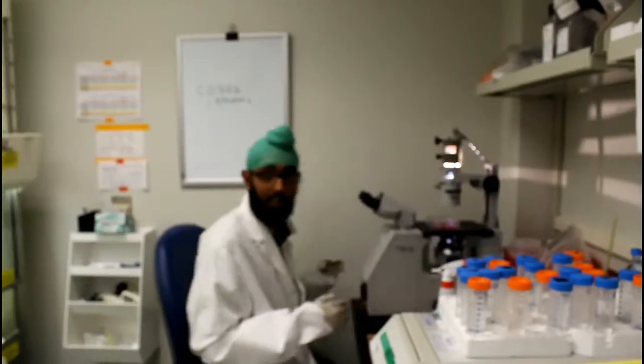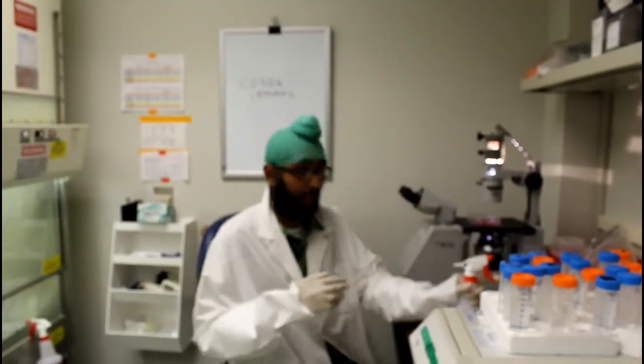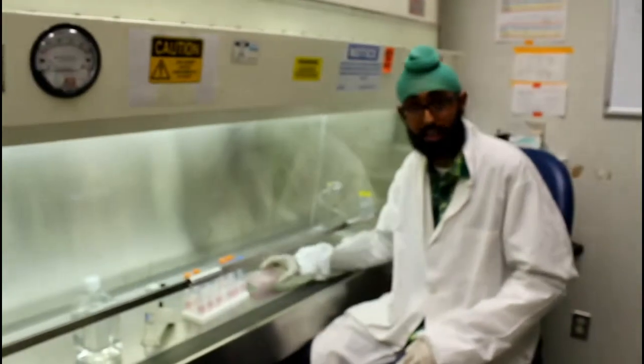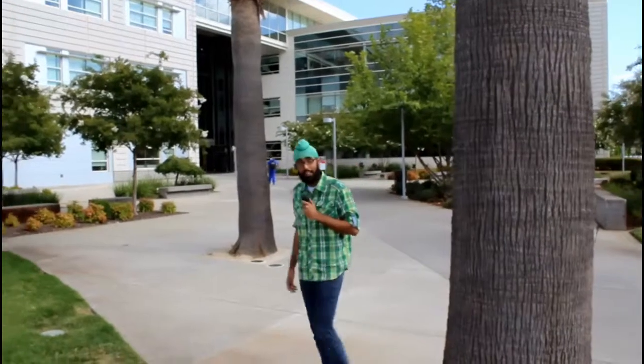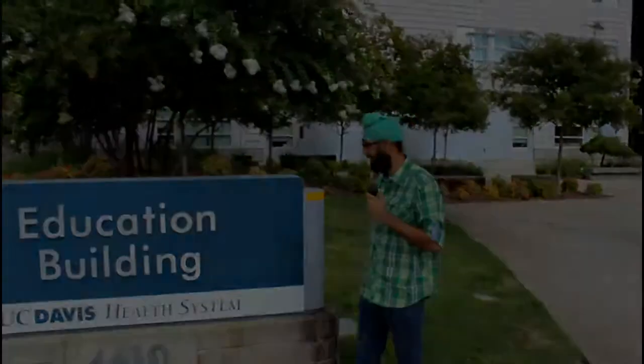It looks like so far the adipocytes are differentiating at a faster rate. According to our sources, this is no surprise because fat is usually easier to grow than bone. This is why the osteocytes have fallen so far behind. Chondrocytes, however, are on a race of their own, as they were disqualified earlier for not following proper 12-well procedures. Now they race in their own private conical tubes. This race may take a few weeks, but we promise to keep you updated here at the clinical laboratory.